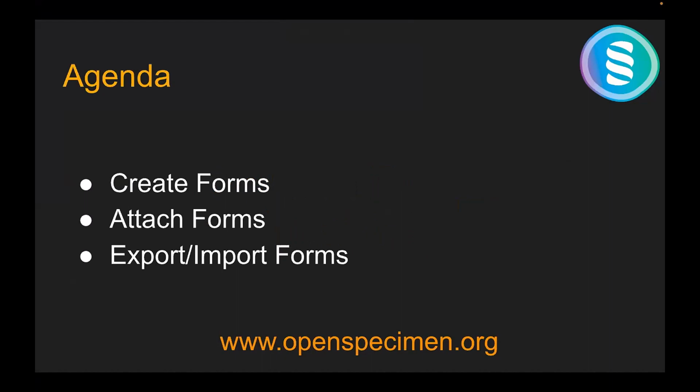Firstly, how to create forms. Secondly, how to attach these forms. And third, in case you have created the forms in one environment, how to move that to another environment. So that is done via export import. So we'll see these three things today.